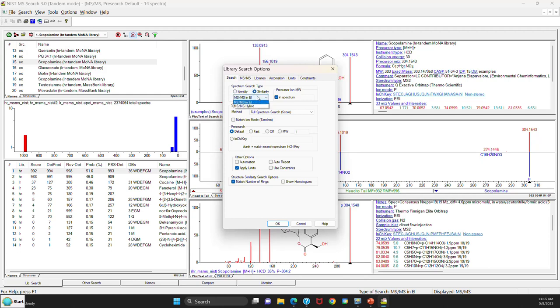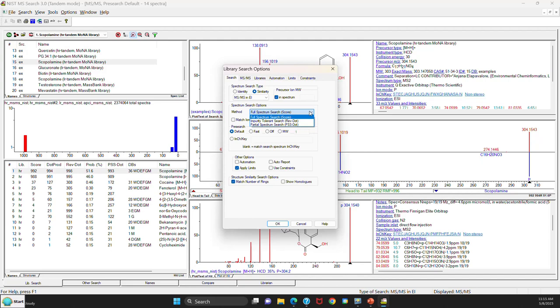You still have the MSMS menu up here or the tab at the top. The other thing you'll notice is that the full spectrum options that determine the method are now a pull down menu as opposed to radio buttons.